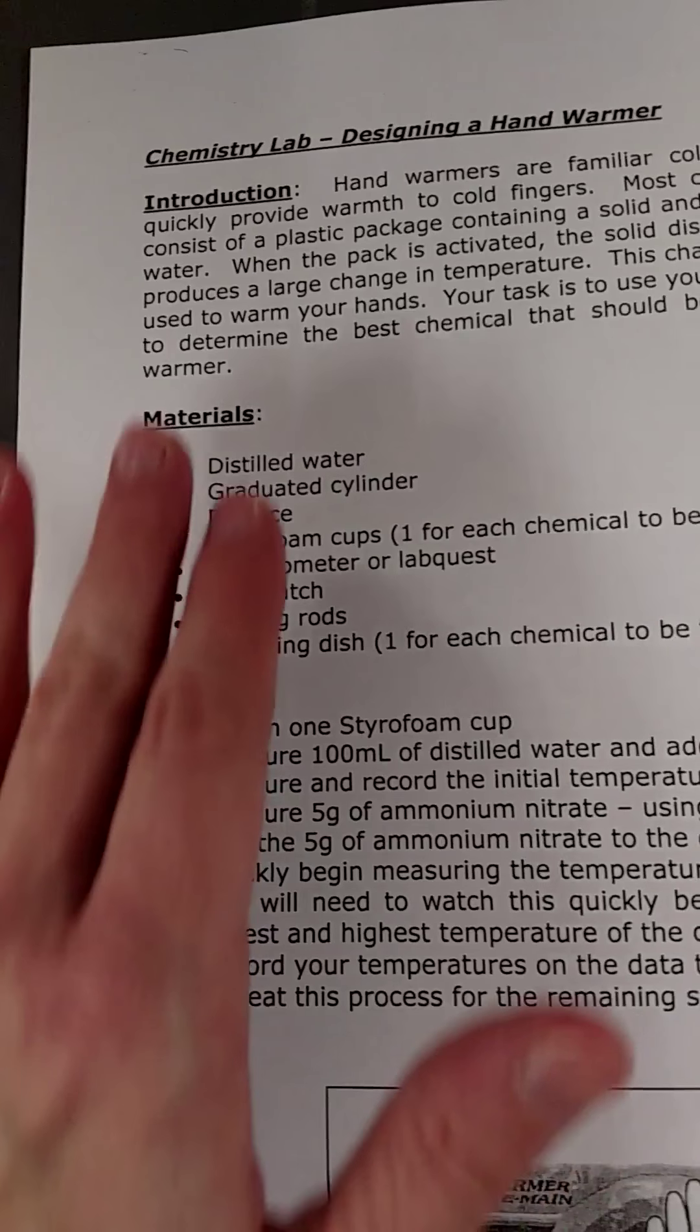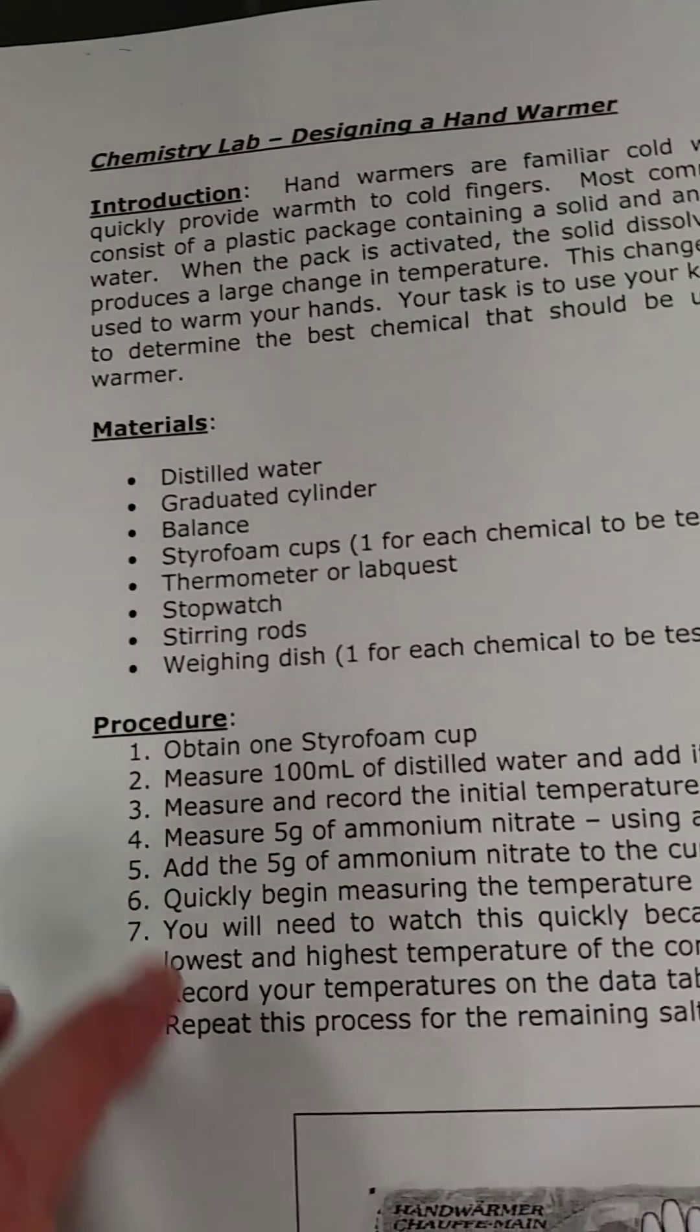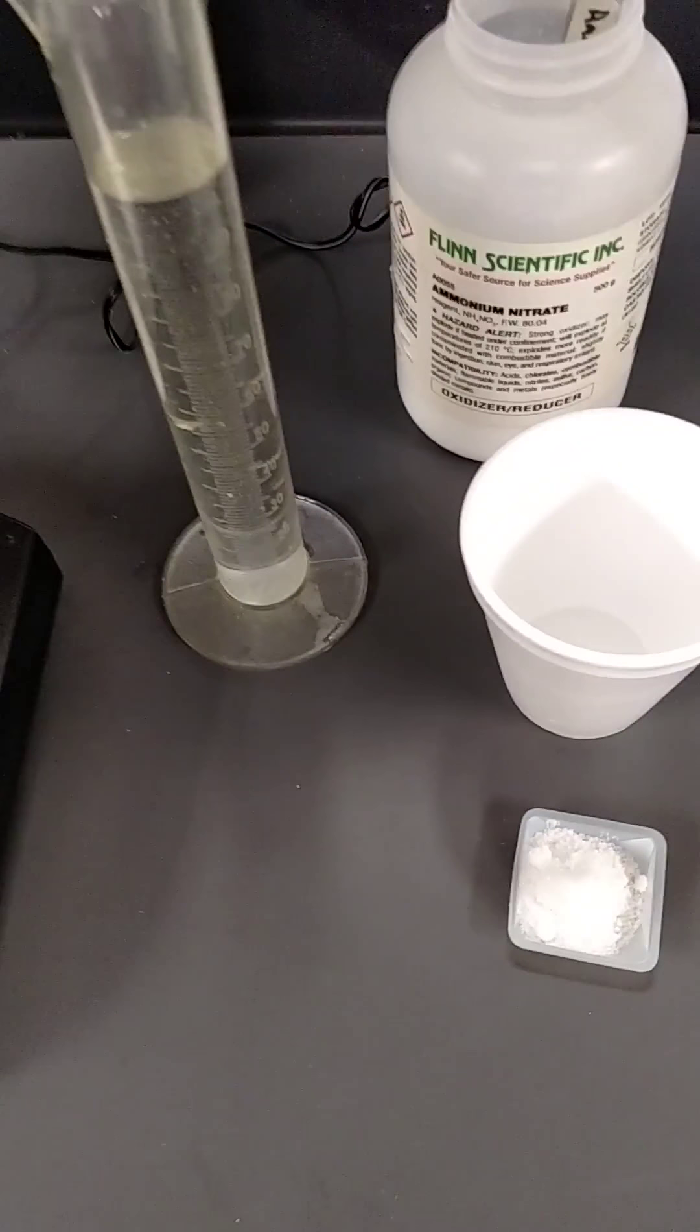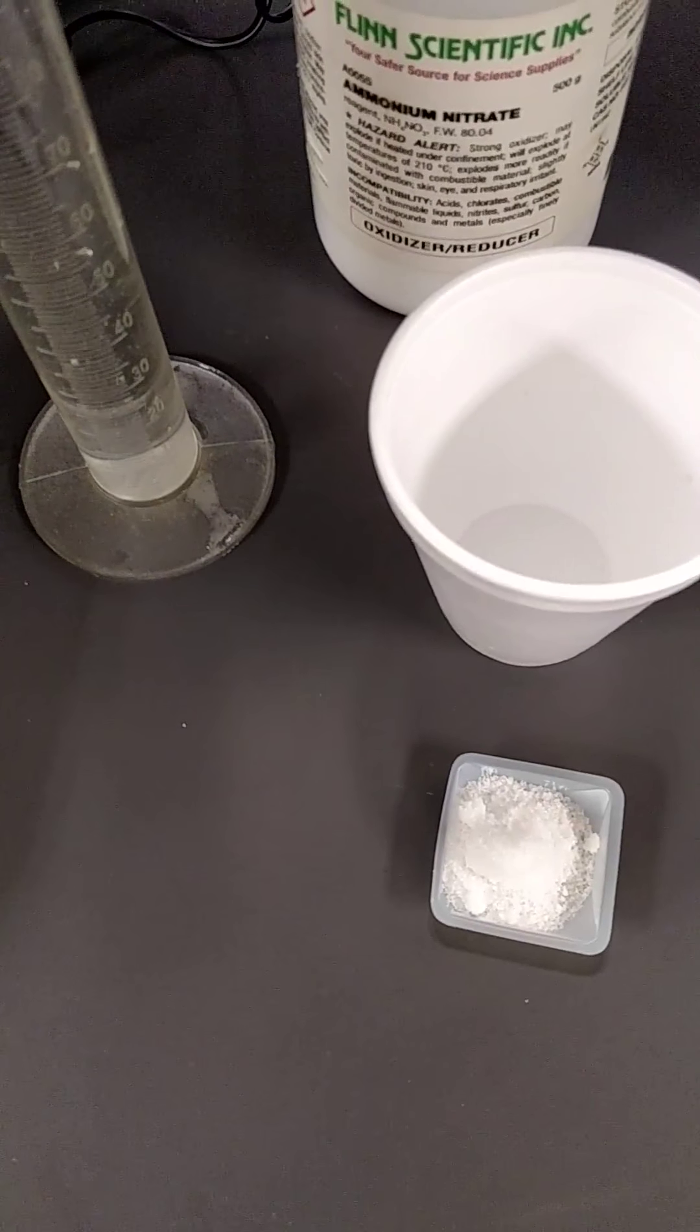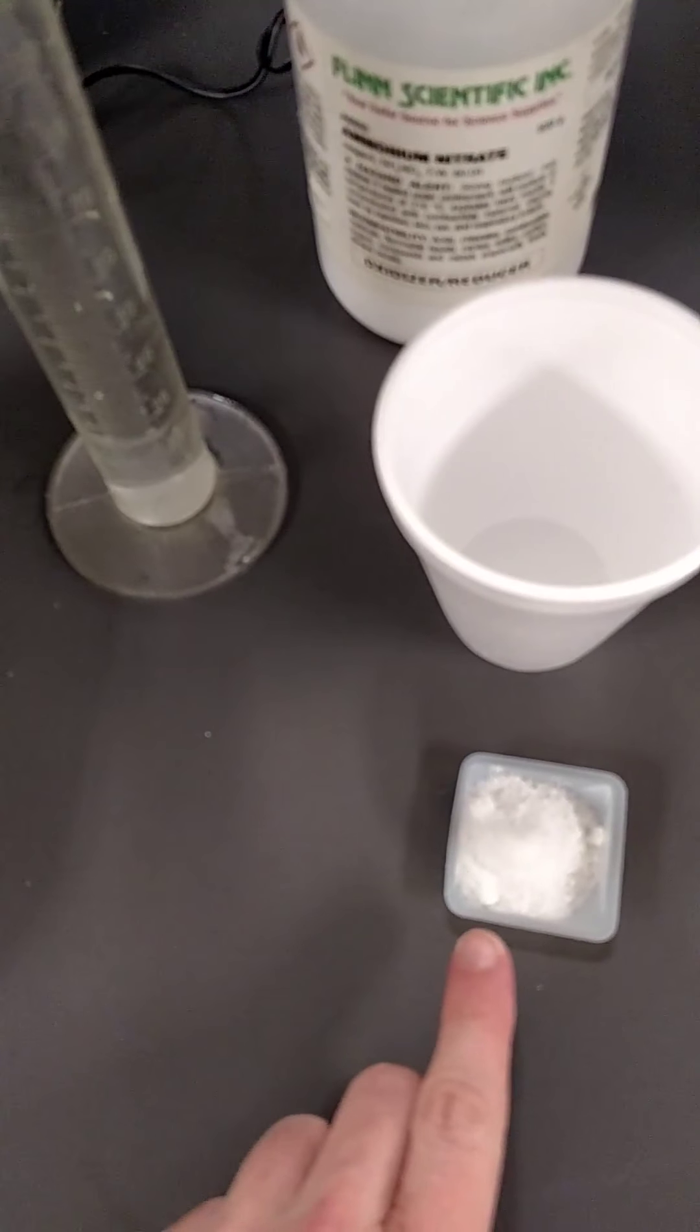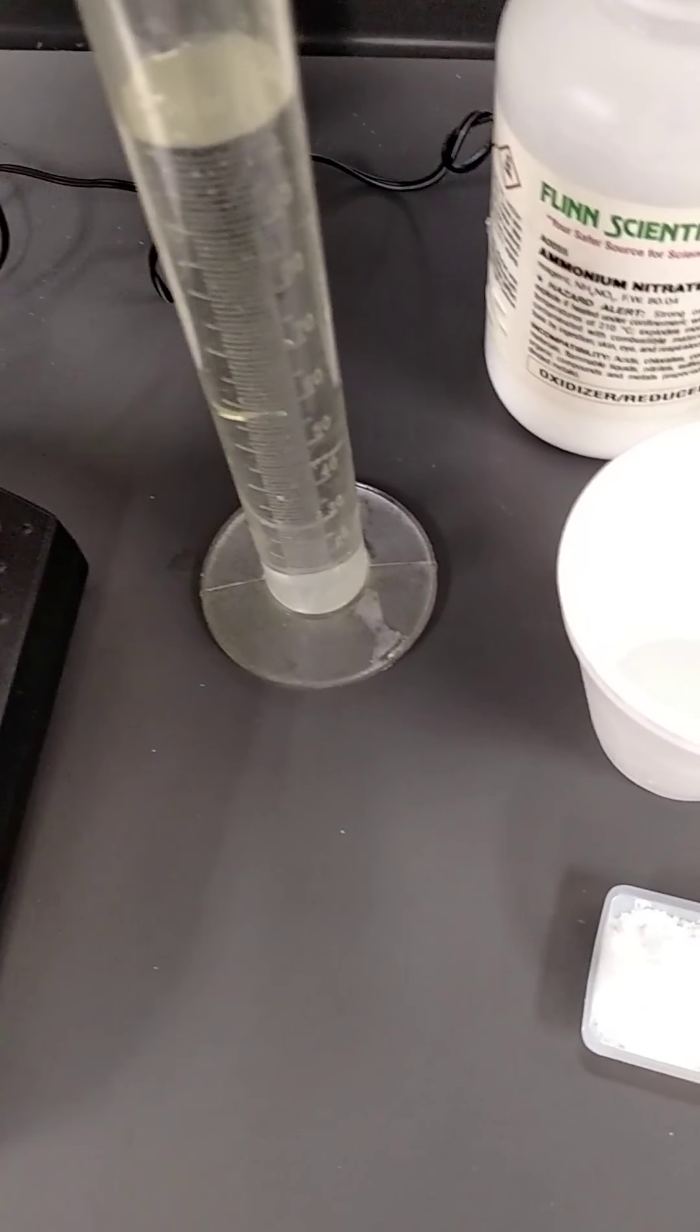So here it's got the list of materials and the procedure, and if you look over here, I've already done the basic steps. So here are the chemicals. There are seven chemicals, and you needed five grams of each one and 100 milliliters of distilled water.